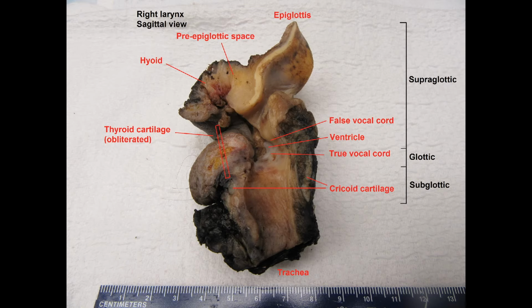And it's nice to know if that is happening in this particular patient. If there's dysplasia coming down toward the tracheal margin, then that implies that there could be further dysplasia beyond the tracheal margin that's just not being sampled, and that makes this patient high risk and they should be monitored a little more frequently.